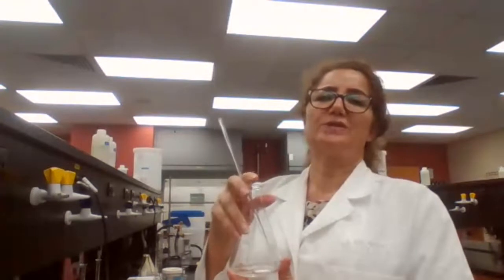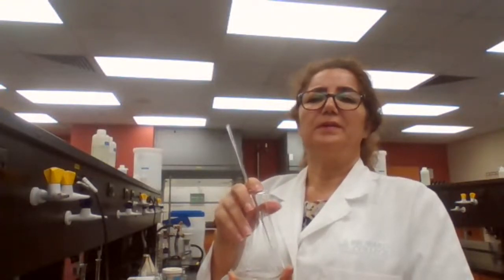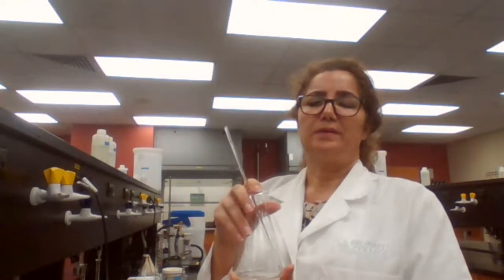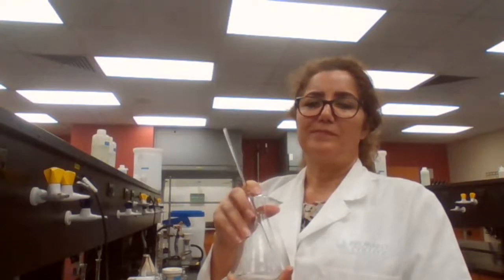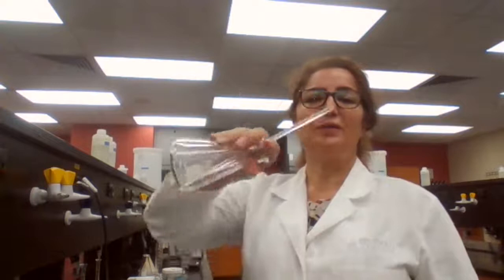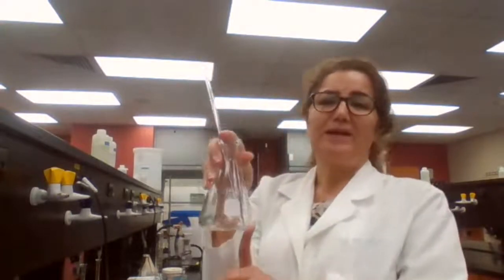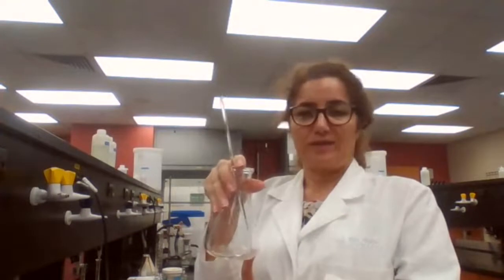Would that make the solution saturated? Yes or no? How would you saturate a solution that is not saturated? If you pour some out, obviously, that was just a silly joke. It's not going to saturate the solution that is remaining here.